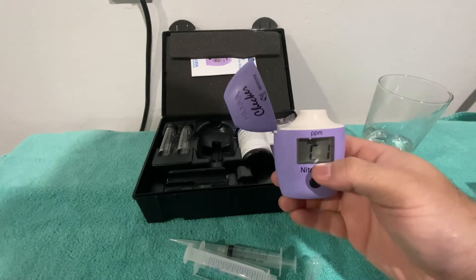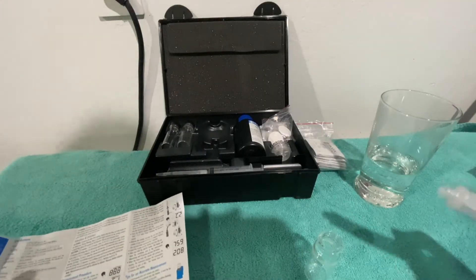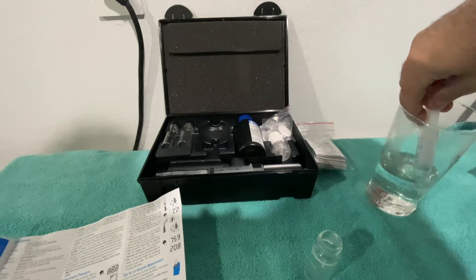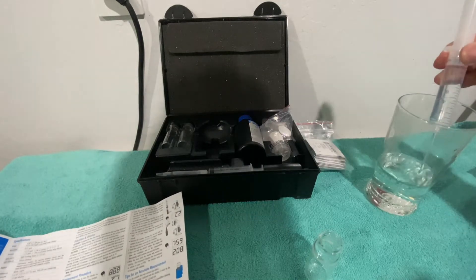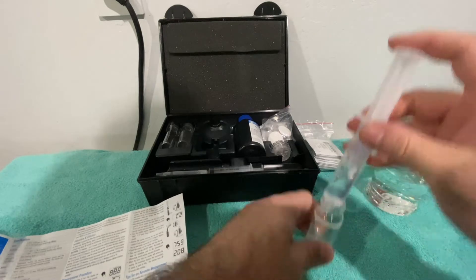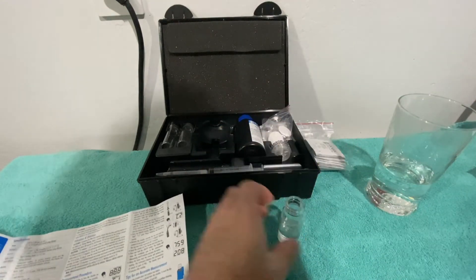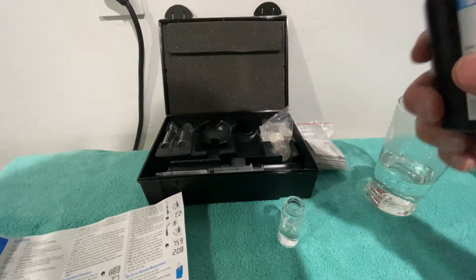Okay, so we've got the battery in there. The first thing it says to do is get seven milliliters into the syringe, then put it into the mixing vial. The next thing it says is to get out reagent A.